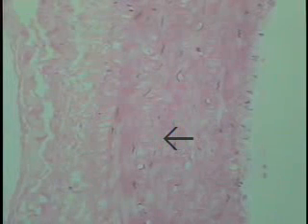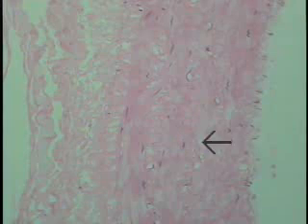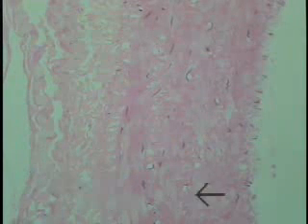And this tunica adventitia will largely consist of collagen fibers. It will have smooth muscle in it that runs longitudinal to the course of the vessel. Here we can see in this particular slide the tunica adventitia, of course, is getting fairly thick. So that may have been torn off down here where we examined it earlier. But one can see the smooth muscle in the tunica media, though it's not nearly as well developed and highly organized as on the arterial side. So this is the structure of the portion of the wall of a typical medium-sized vein.